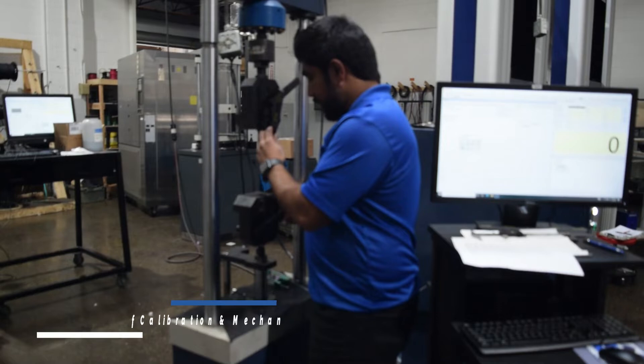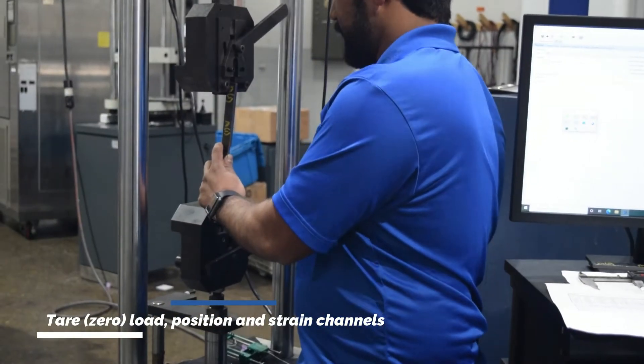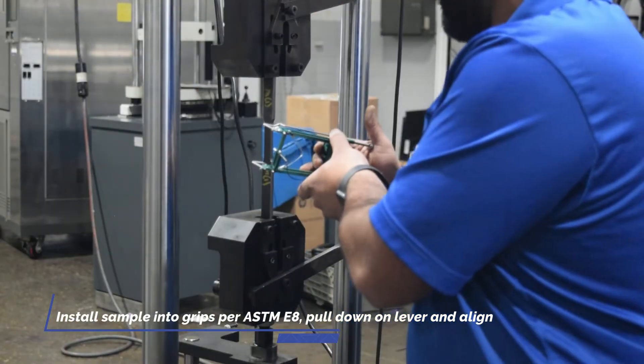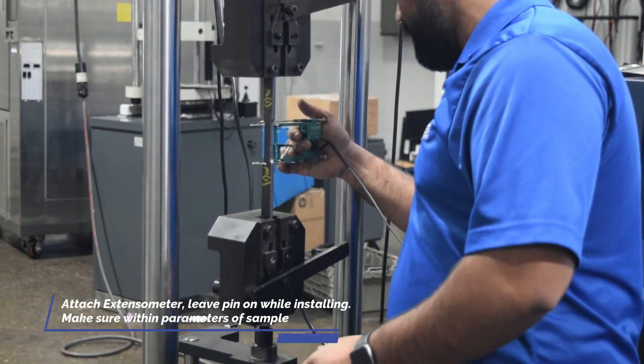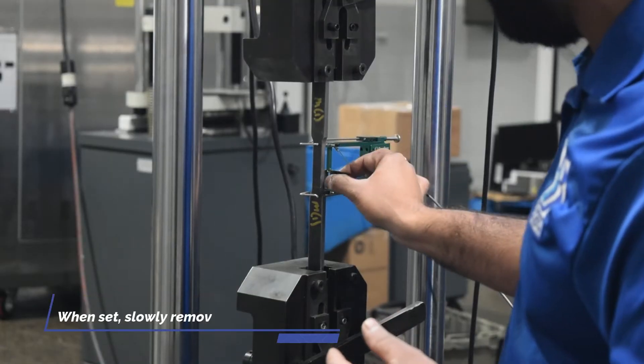I'll show you how it's done. For your samples, use your thumb to push it out, put your extensometer in there. Make sure you slowly pull the pin off.